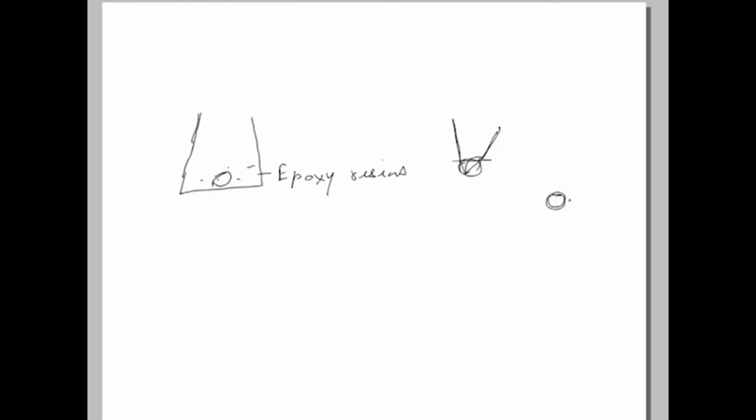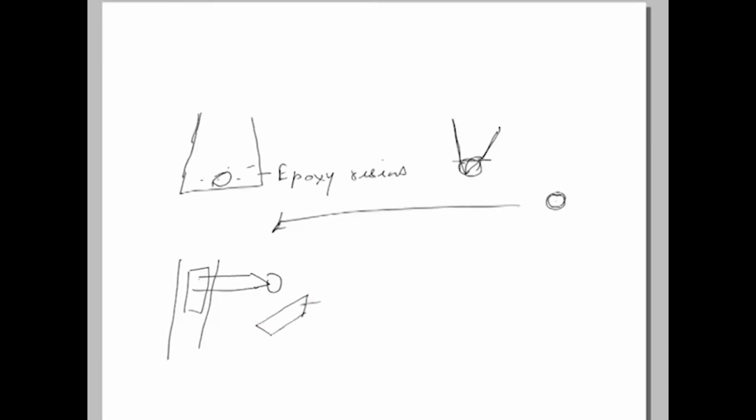So, this could be then taken to the ultramicrotome. As we have seen earlier, it could be simply an arm here and this material which is here will be put on here. There will be a blade, or a diamond knife or a glass blade could be utilized.